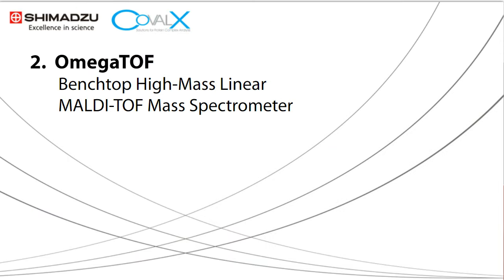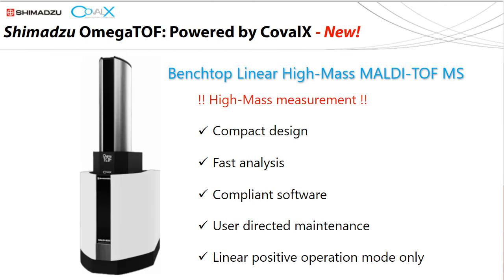So that was some basics on mass spec and some of the fundamentals and limitations of mass spec. Now I'm going to switch gears and talk a little bit about the OmegaTOF itself, about the high mass benchtop instrument that we're promoting with Shimadzu.